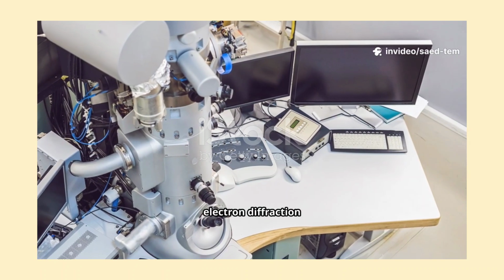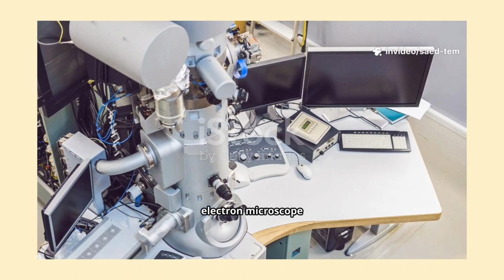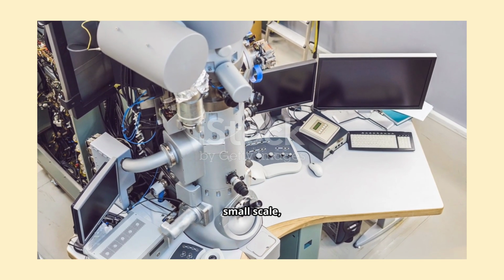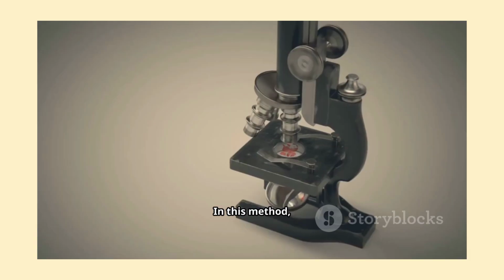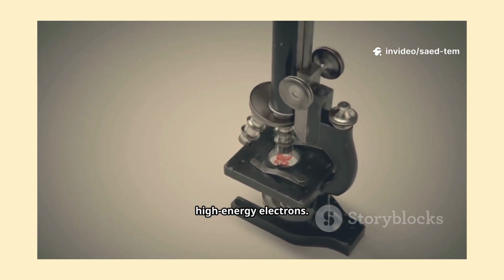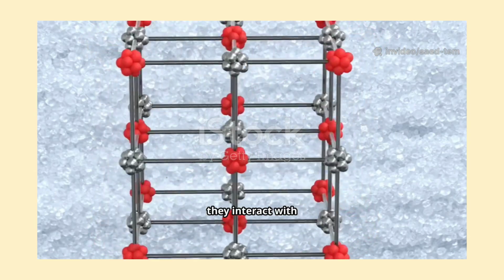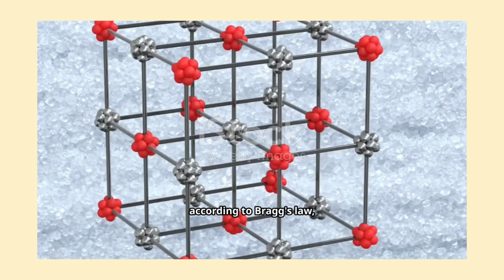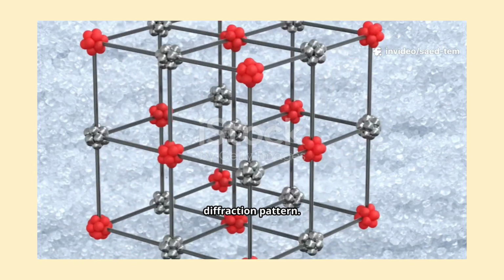Selected Area Electron Diffraction, SAED, is a technique used in a transmission electron microscope, TEM, to study the crystal structure of materials at a very small scale, often down to individual grains or nanoparticles. In this method, a thin sample is illuminated by a parallel beam of high-energy electrons. When these electrons pass through the sample, they interact with the orderly arrangement of atoms in the crystal and are diffracted according to Bragg's law, producing a distinctive pattern of spots called a diffraction pattern.